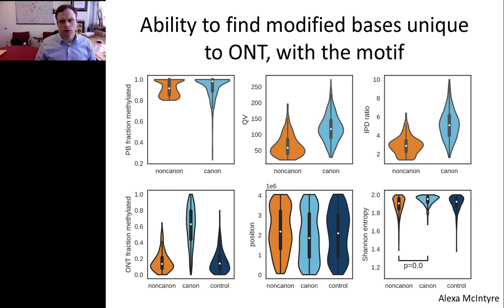The next thing we're doing, again, these data will be released relatively soon. We're just finishing the latest version of the base modification caller from PacBio, and then we'll release all these data likely by AGBT or maybe the ABRF meeting, so within a couple of months. And again, for people to use as a part of their own development for tools and methods.